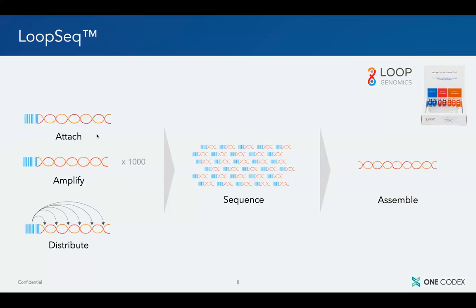So today we're going to be talking a little bit about, I think most on the line are probably familiar with short read V3, V4, or other variable region 16S sequencing on Illumina's platform. What we're going to be talking about and introducing today is specifically LoopSeq data, which is a type of synthetic long read data that can be produced with a kit from Loop Genomics, pictured up here in the top right.